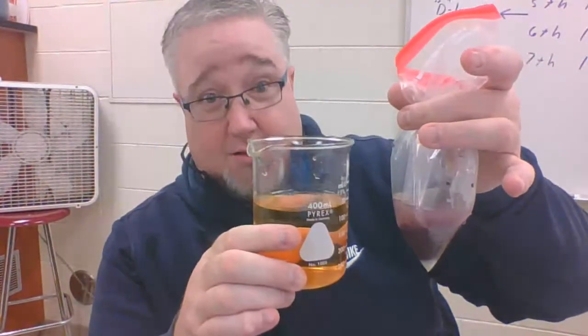And think about the permeability of this bag. Did this bag allow anything to pass back and forth? Is it permeable to any of the substances that we've talked about? Water, iodine, starch. Think about those three substances and which of them most likely got into this bag to cause that color change.